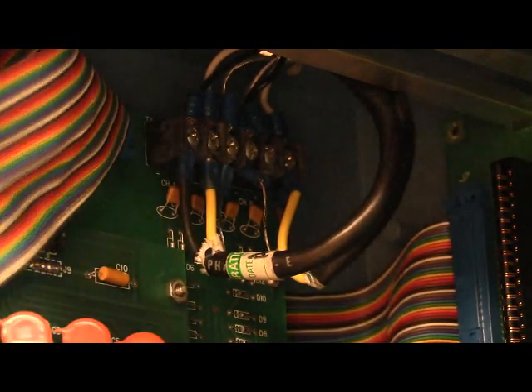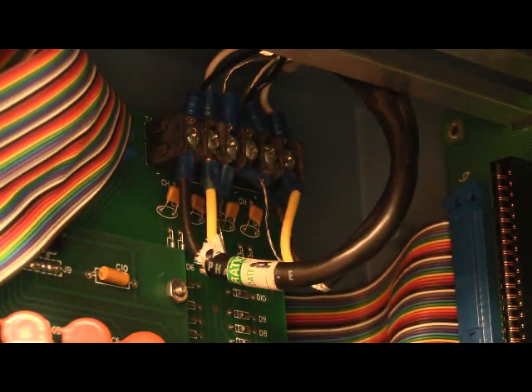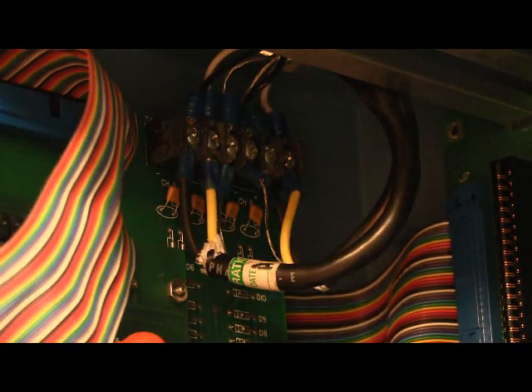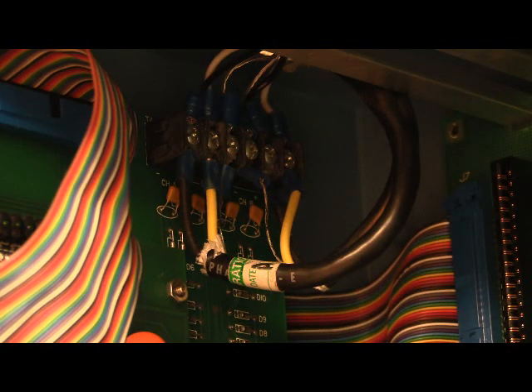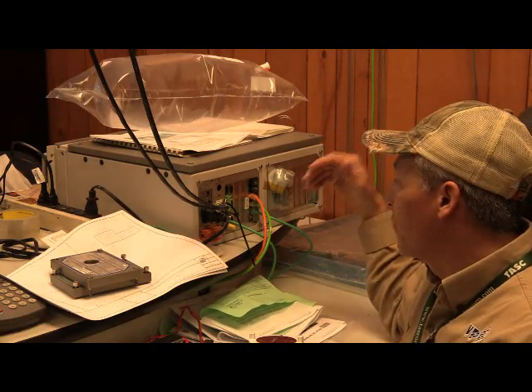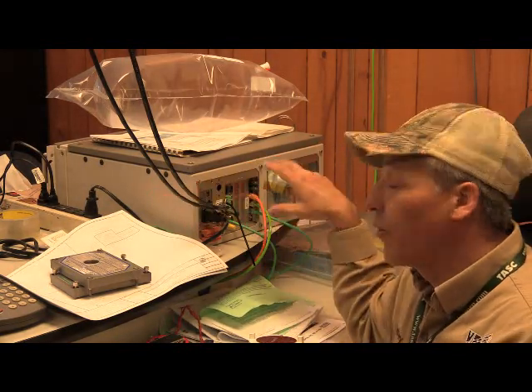All right, so we have our data highway coming in, channel A, channel B, backup. We have two of those heading out and going back over to wherever we actually want it to go. In this case, we're going over to an NAU. This is an NAU, a network access unit, which allows you to have multiple different devices coming in and talking on a network, and then you being able to talk to it through the computer.